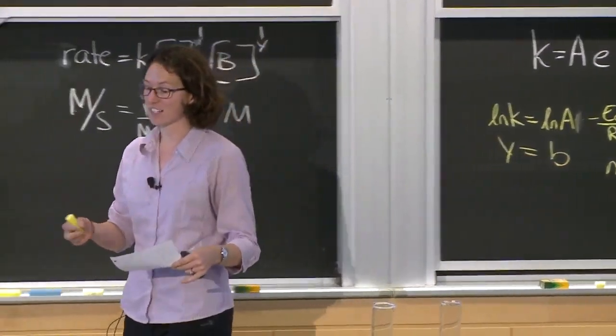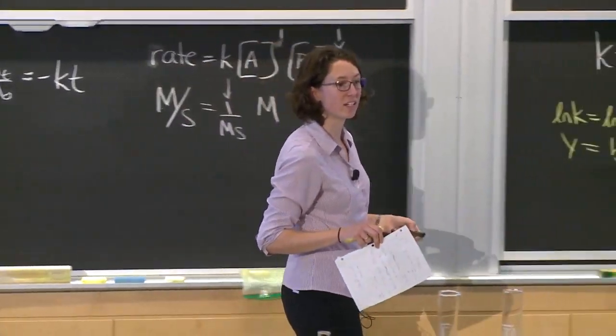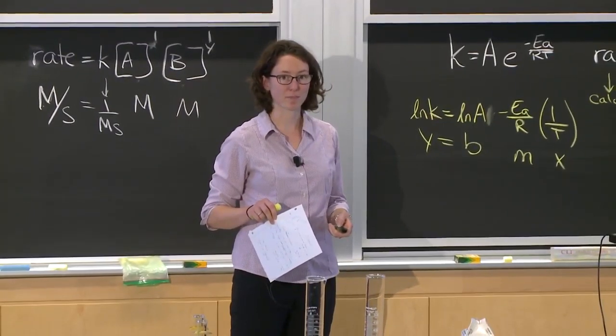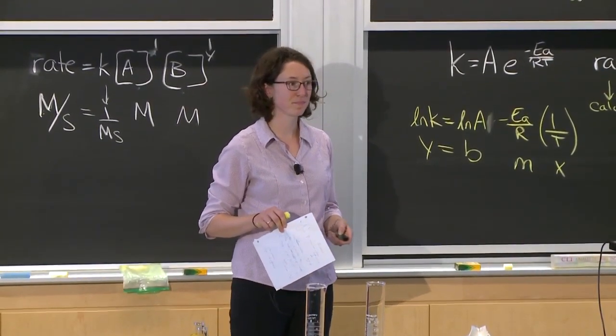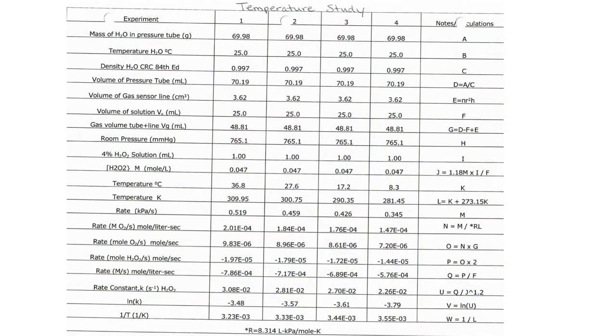And that is essentially day 1 and day 2 of the lab. Do you guys have any questions about that? There's a lot of math. So again, there's another data chart that you can make for day 2 of the lab that has all of the information that you're going to need for these calculations.